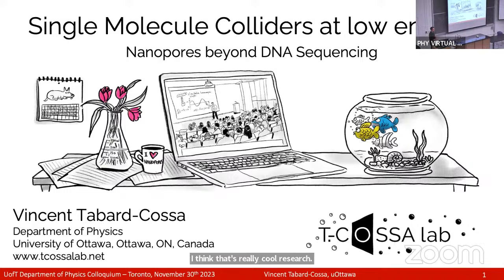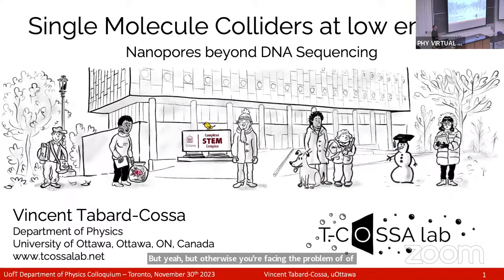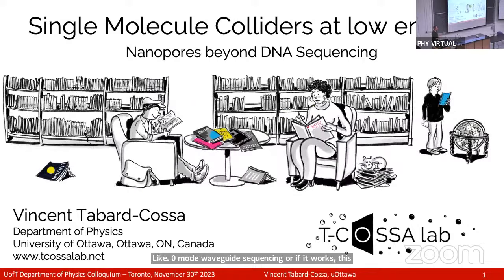To be done, but otherwise you're facing the problem of having things diffuse inside your well. But we know this works, right? Like zero mode waveguide sequencing, where it works this way, by having things diffuse inside these wells.